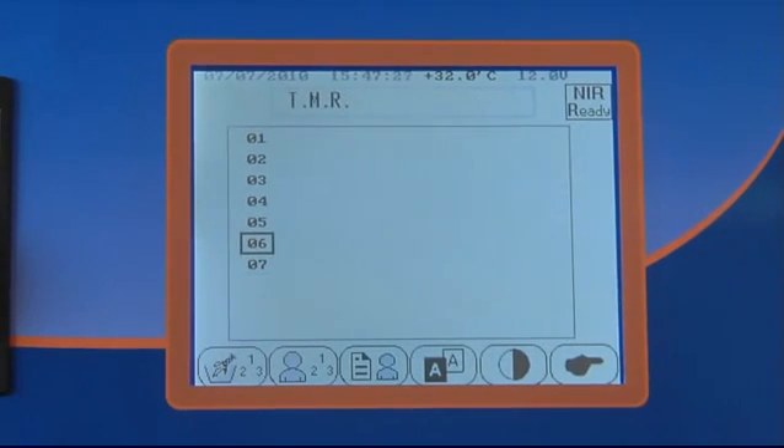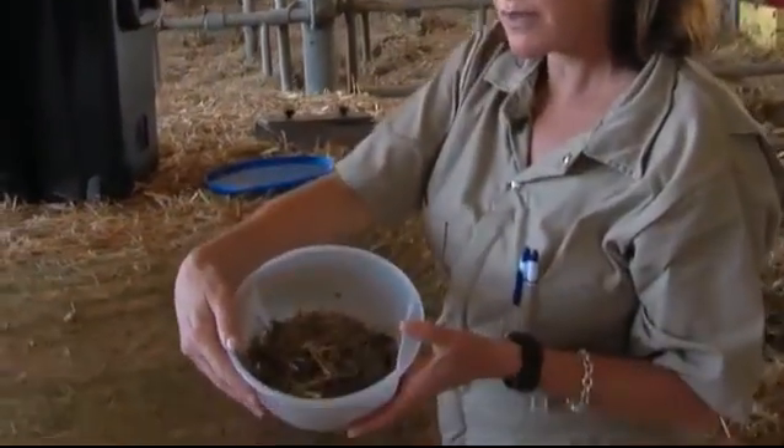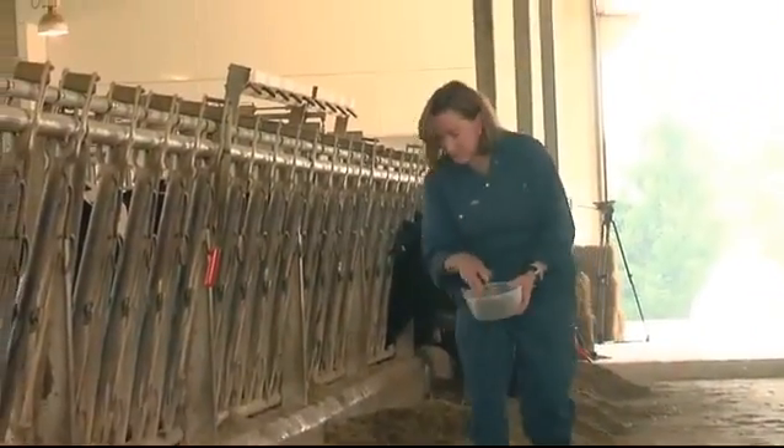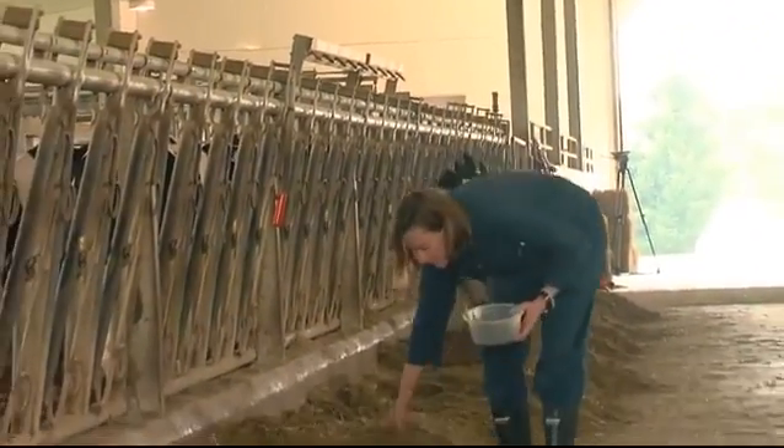Today we're going to do an analysis of a producer's TMR. That's the sample that was taken down through the bunk at early feed out, middle feed out, and at the end of feed out.